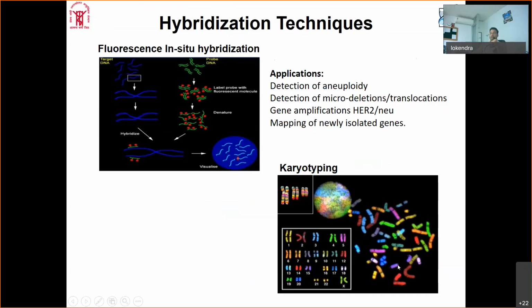If there is a deviation from the standard chromosomal pattern, then specific chromosomal changes can be identified, and it is reflective of various disorders like Down syndrome and Fragile X syndrome. There are so many genetic disorders which can also be characterized by changes in the chromosomal pattern.